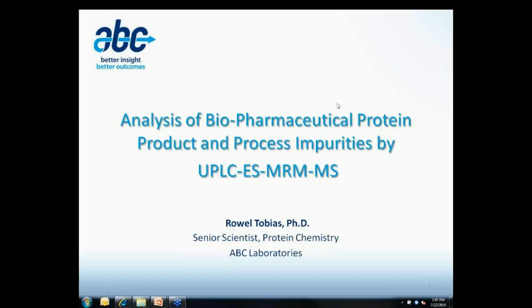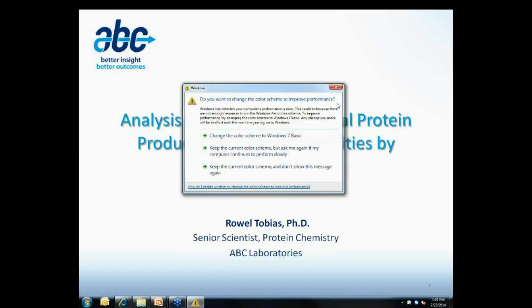And if you've worked with small molecule drugs, this is a quite established technique, particularly in the bioanalytical or PK, pharmacokinetic studies, and in the quantitation of small molecule drugs. Now, the basis for MRM is differences in mass.